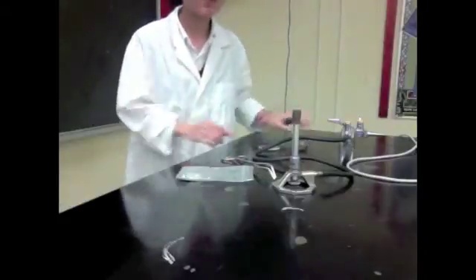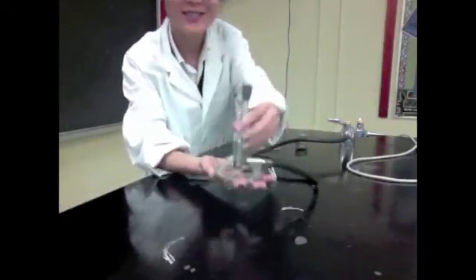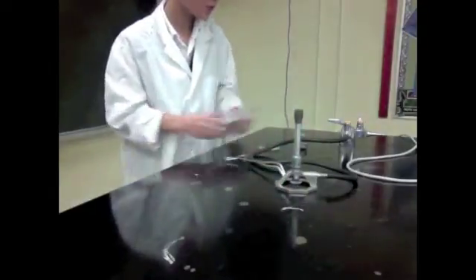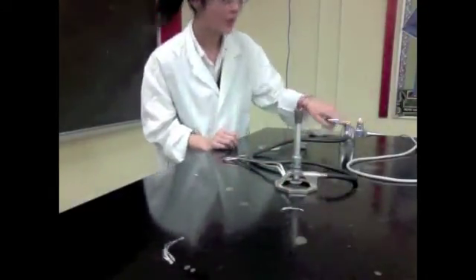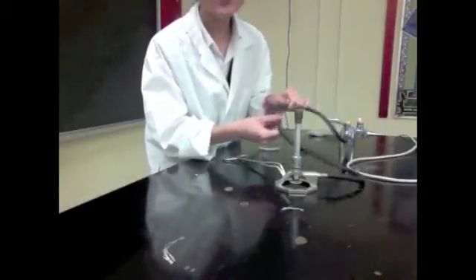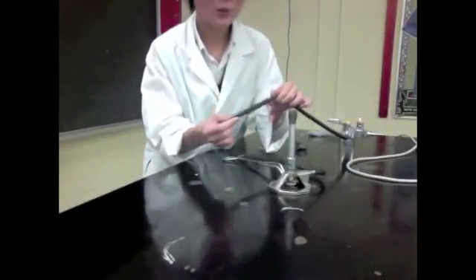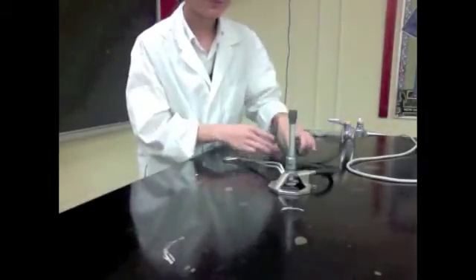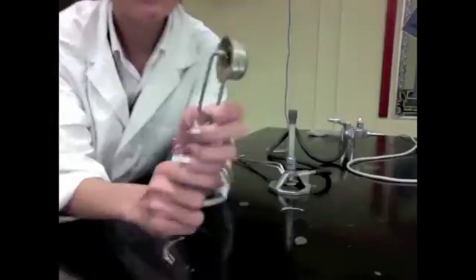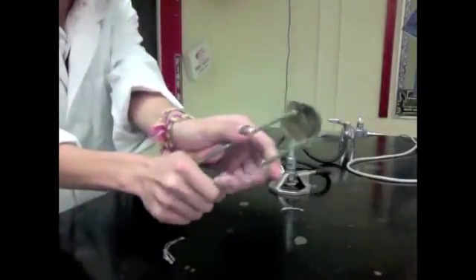We're also going to need a Bunsen burner which looks like this, and the Bunsen burner is going to be connected to the gas valve here by a piece of rubber tubing. So first you want to check that the tubing has no cracks in it or no slits, as this could leak gas everywhere and that would be bad. You're also going to need a flint which looks like this, and it's basically a spark to use to light the Bunsen burner.